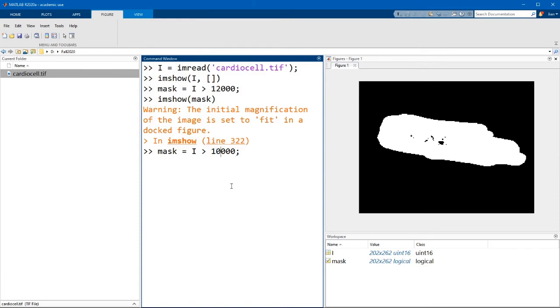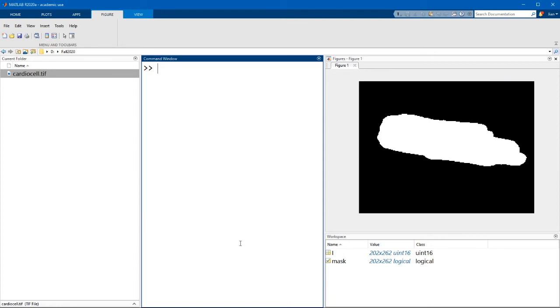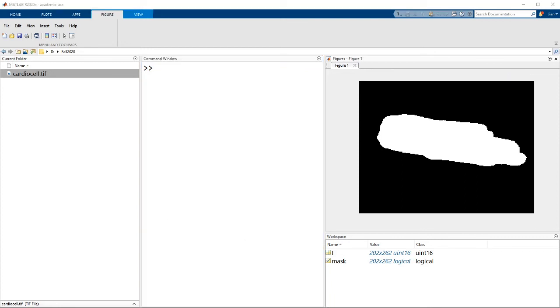I'm going to bring this down to 10,000 so that we would include more of the dark pixels. And let's display our new mask. And that looks pretty good. There may be a little bit of trial and error, but you can generally settle on an intensity value that looks about right.